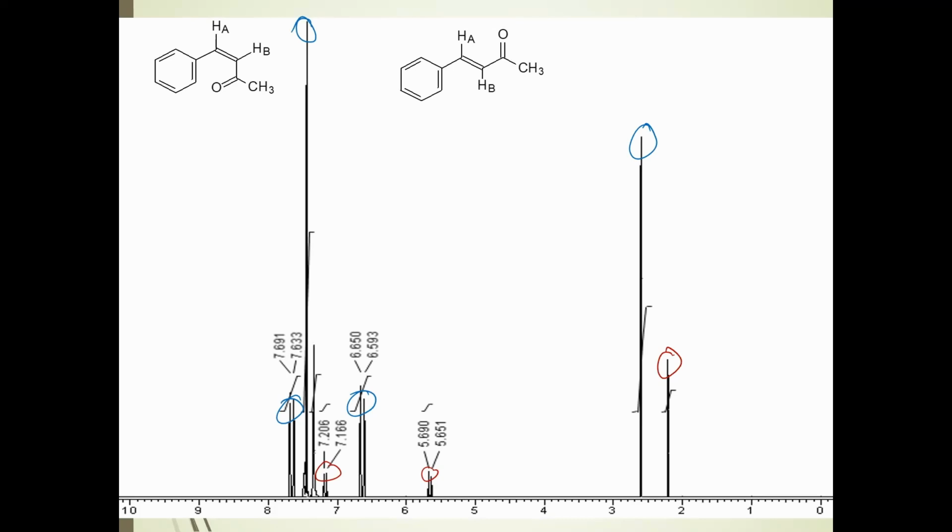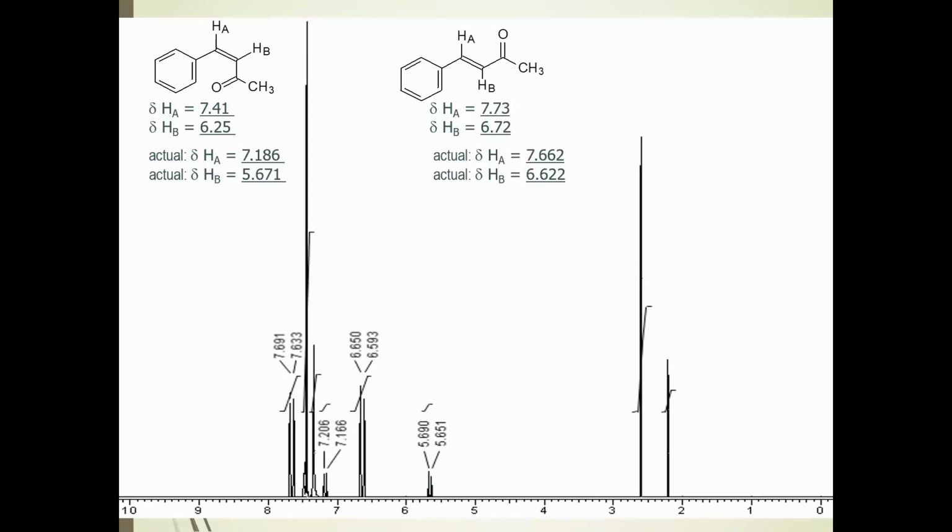How do we distinguish them? Exactly the way we've been doing. Calculate your chemical shifts, see what matches up.